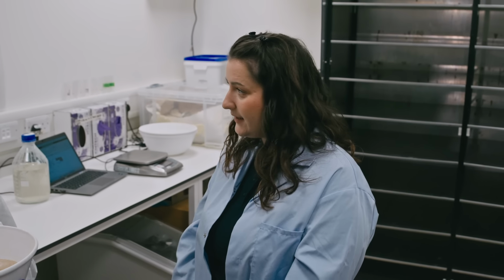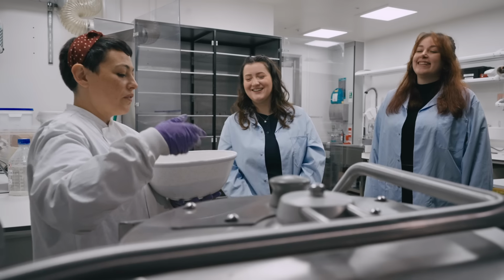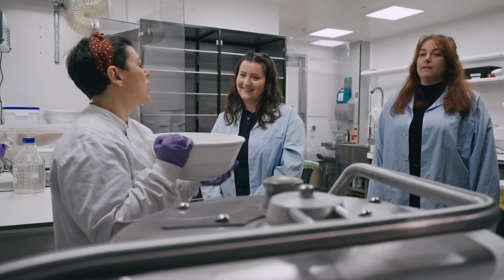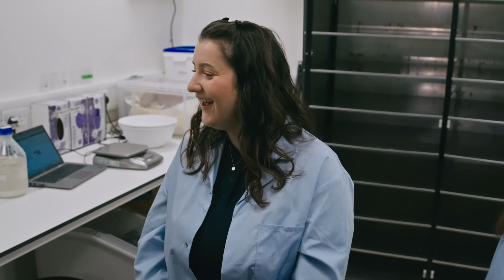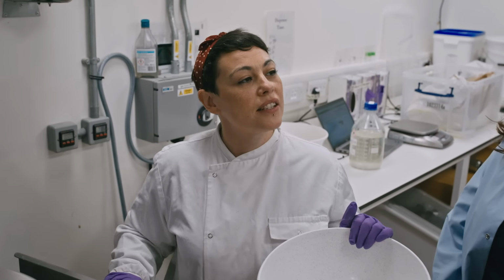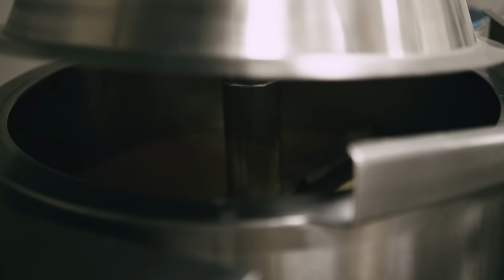So do they not all eat the same food, the flies? Depending on what sort of flies, depends on what sort of food they've got. Yeah. So the exotic flies get the Kyorin food, don't they? So the standard food is just not good enough for them. They are incredibly fussy. And we like to treat them very well here. Were you a chef before this?